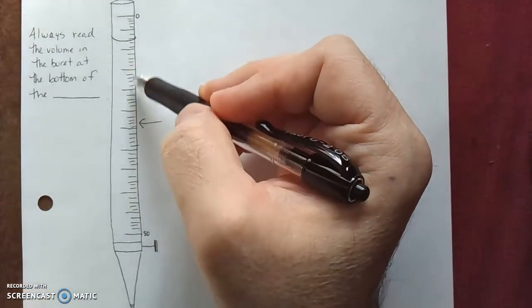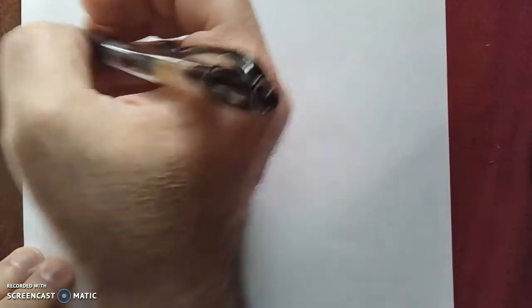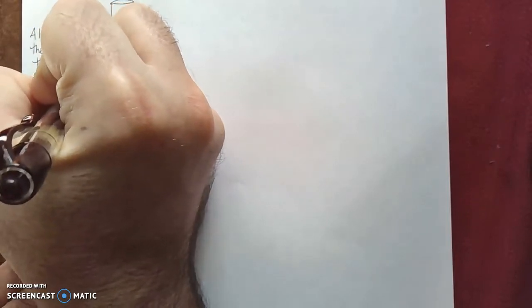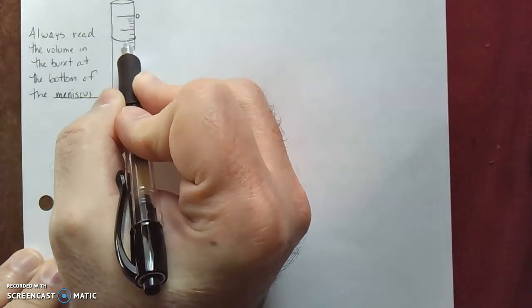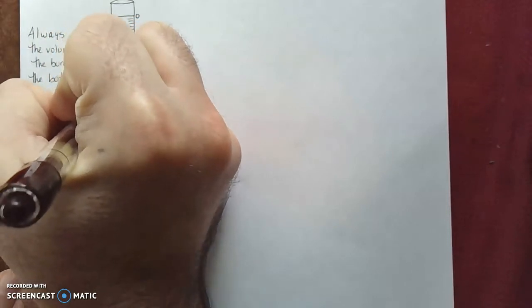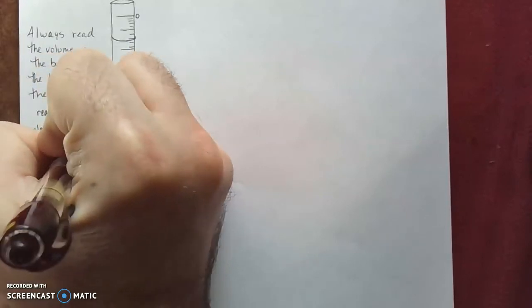And we always are going to read this to 2 decimal places. And we always read at the bottom of the meniscus. So right here would be an example of the liquid, and it forms that U shape. So we always read it at the bottom, and it is read to 2 decimal place values. The last place value is estimated.